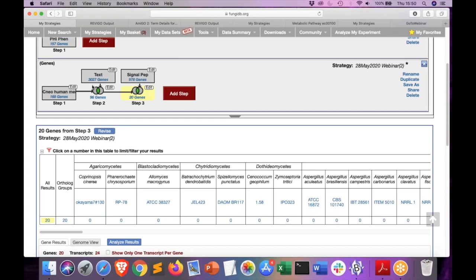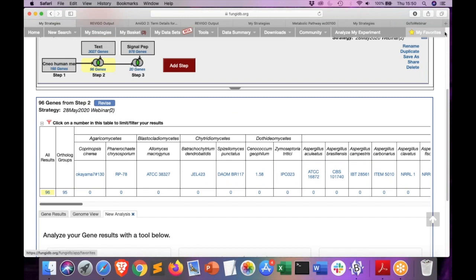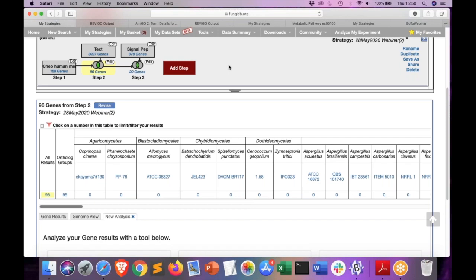In this case, it may be linked to motility, because the kinesin domain may be in a protein that binds to microtubules. So you can imagine a subset of hypothetical proteins that will have functional domains and, as such, will have association with GO terms. There will be cases where it's a hypothetical protein with no information about its function, and then it won't have an associated GO term.